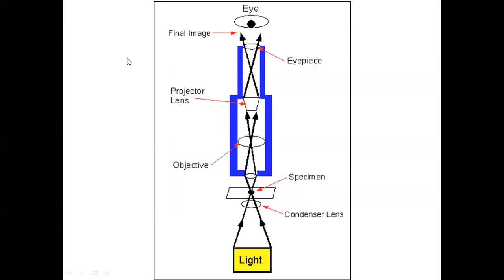Okay. So the light is finally reaching your eye. Outside this eyepiece, we are viewing. Finally, how the light is traveling: from the illuminator, that is your halogen source, through the condenser, through the aperture, through the sample, the light is focused, reaching your objective lens, which varies into different magnifications.